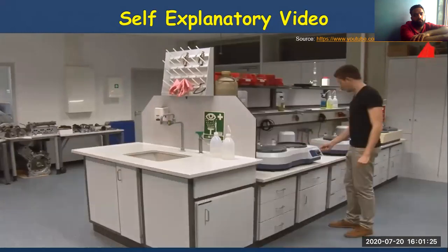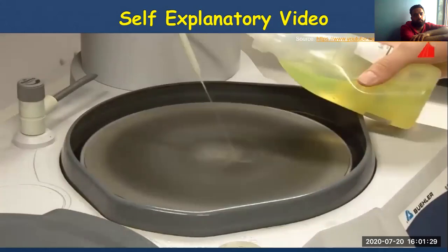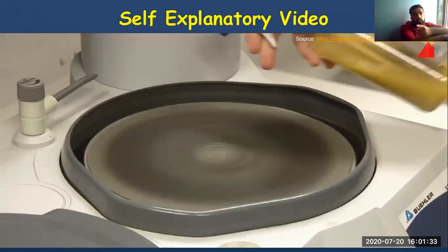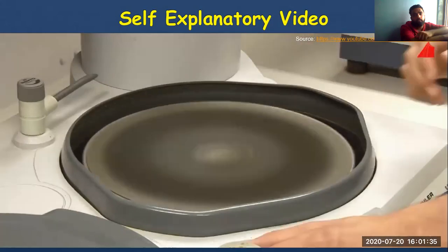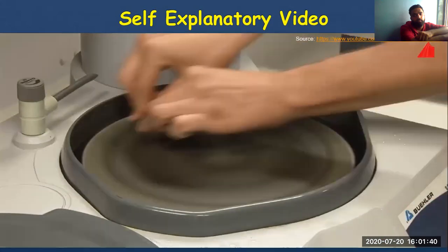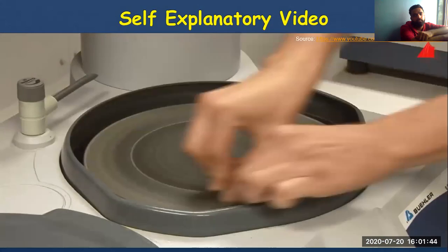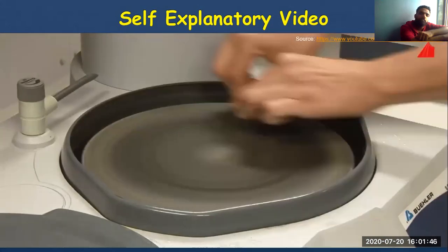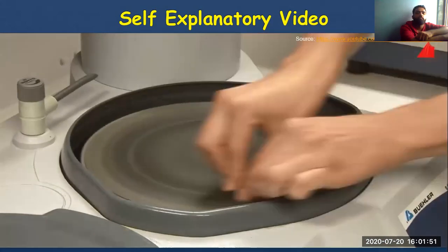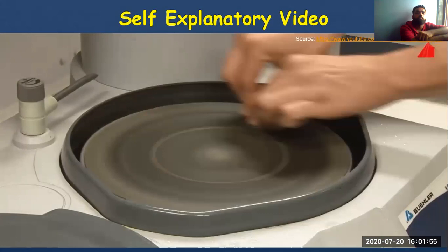He chooses a polishing disc equipped with hard cloth of low resilience, moistens the cloth with a suitable lubricant, and adds 2 splashes of diamond suspension of particle size 6 micrometers. Under counter-rotating motion, he presses the specimen with high pressure onto the polishing cloth. The diamond particles have settled on the cloth and are now abrading the surface. After about a minute, all grinding grooves have been removed, and the specimen surface already has a shiny appearance.